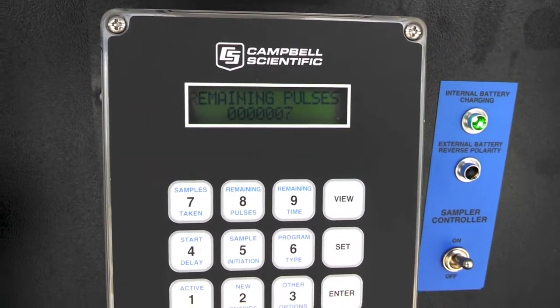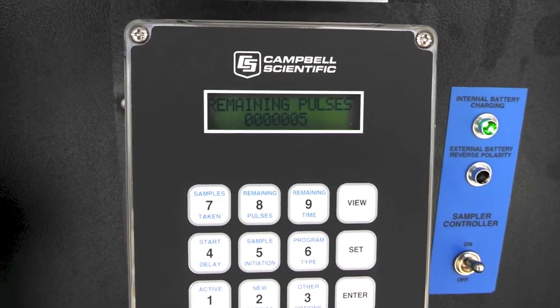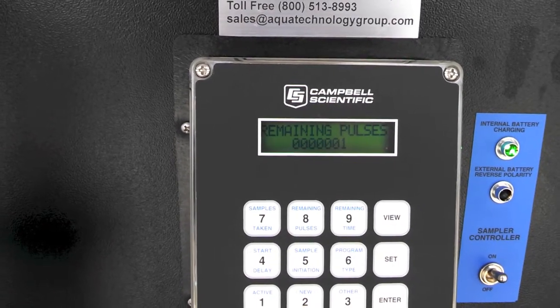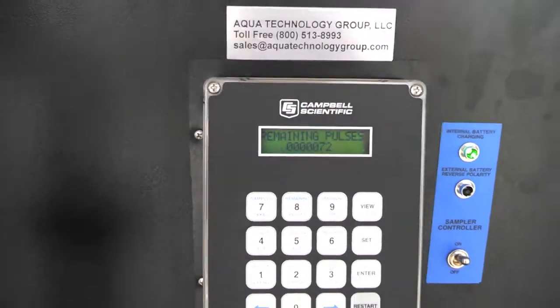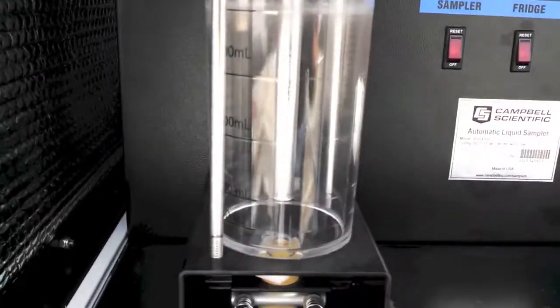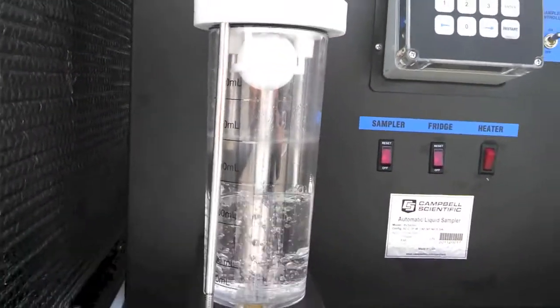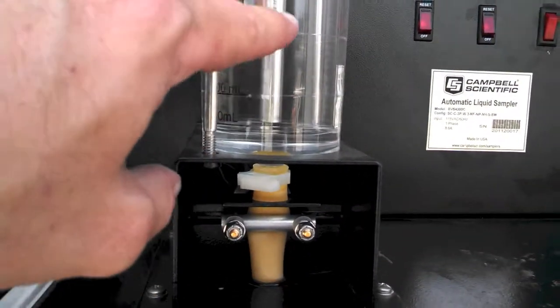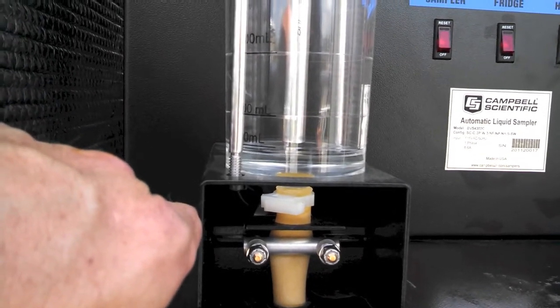We're down to five pulses left. Now we're going to initiate off the flow, down to the remaining pulses, and one more time on the sample cycle. You can hear the air being purged up and out through the line, down the hose, and out into the intake below. Now we're drawing the sample back in, all the way up to the rod and back down to our metering point, which is set by this center rod. Now purging — make sure you have the right volume — and dumping the sample into the container below.